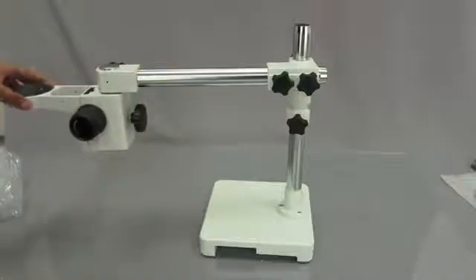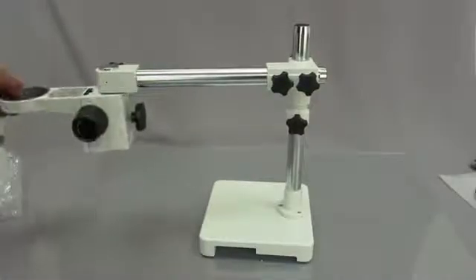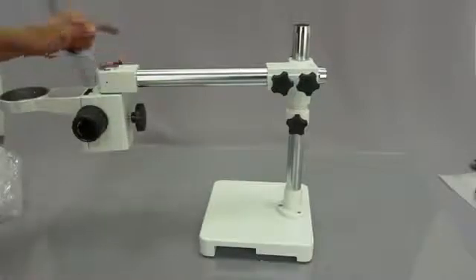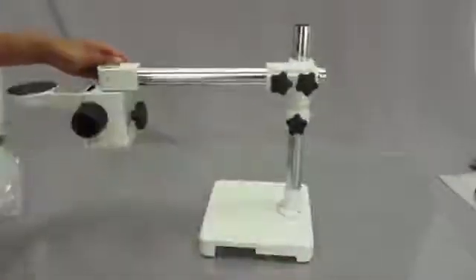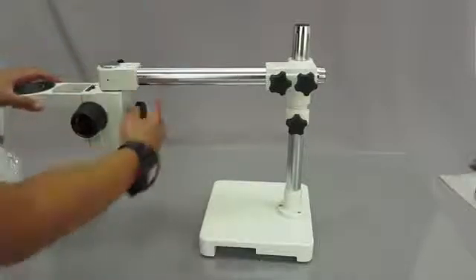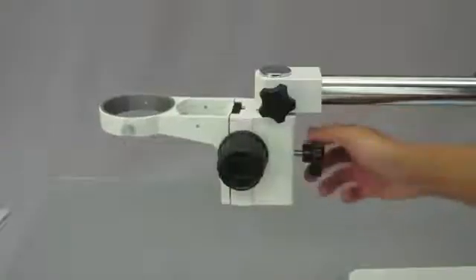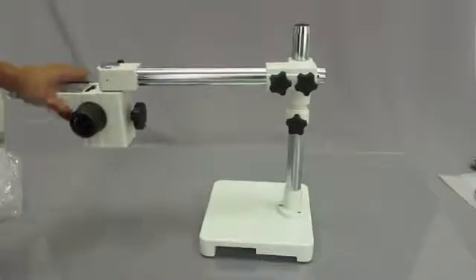Okay. Now that you can see it's in, this can swivel around. If you wanted it to stop doing that, there's another knob right behind here. I'll swivel this around so you can see. This knob right here stops the focusing rack from moving. So I'm going to tighten it. And I'm also going to tighten this right here. That will stop the focusing rack from swiveling left and right.